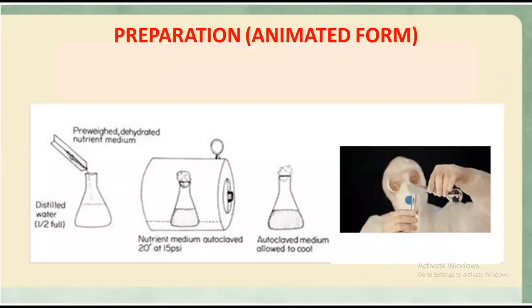If I show you the preparation in animated form, first you have to take the powder media and dissolve it in distilled water. After that, you have to cover it and place it in an autoclave, just to remove all the microorganisms from it. So you have to sterilize the media.